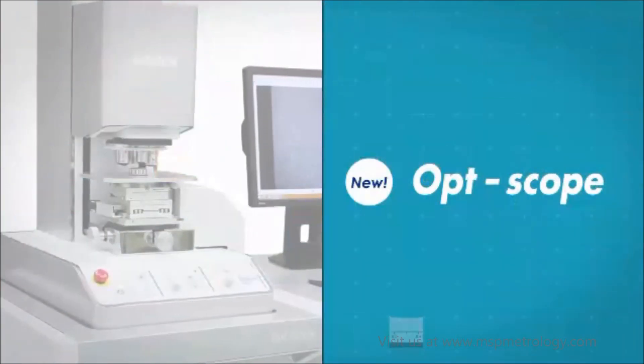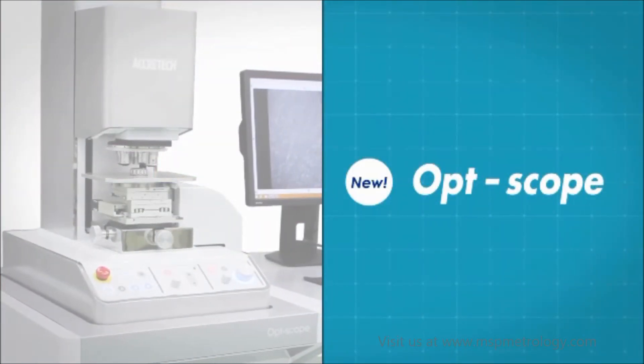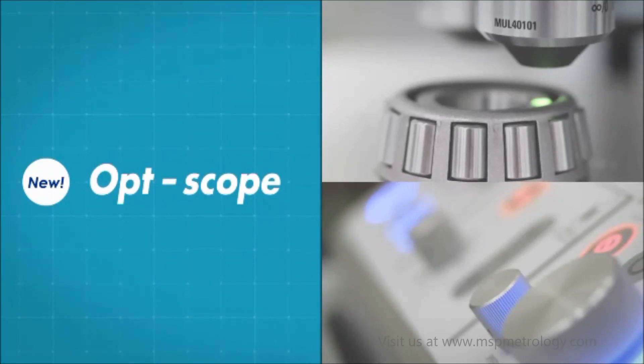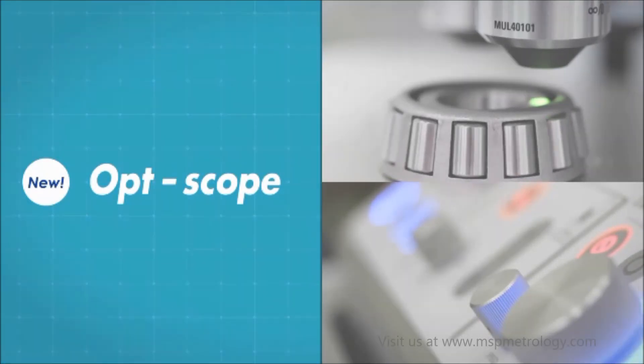With a variety of functions and analytical methods, the Optscope helps customers find solutions and meet their future needs.